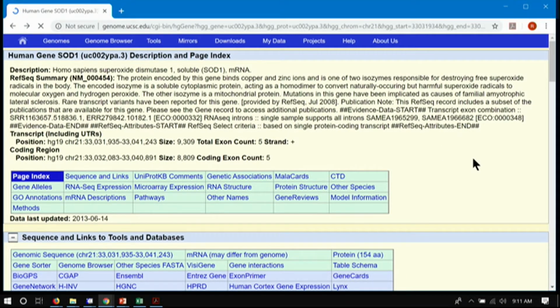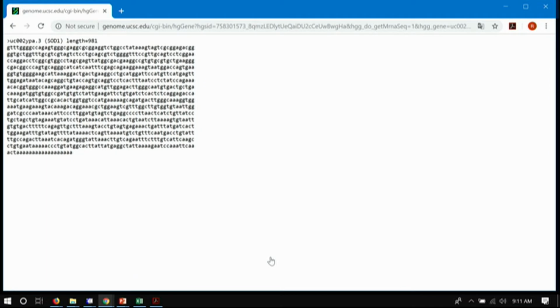I really appreciate that. So I clicked into the gene. Got it? I clicked RNA right here at the top of the second navigation box. The mRNA that supports this gene annotation, here's the RNA itself. I grabbed a chunk of RNA out of there and then did Control-C. I'm glad I made it long enough, because it hit in two places, and BLAT's not so happy when you have two small pieces that are separated by an intron. And so then I copied that, and then I went back.